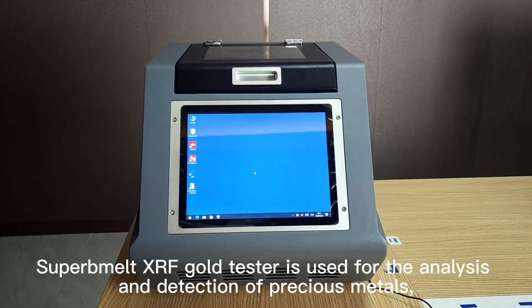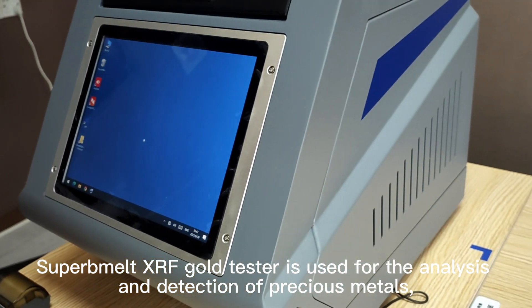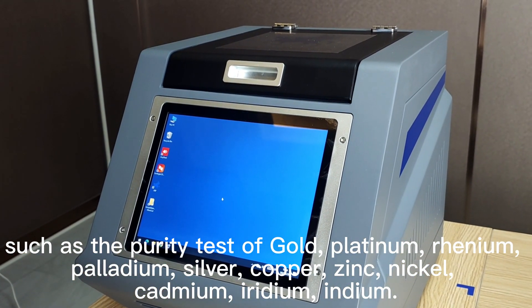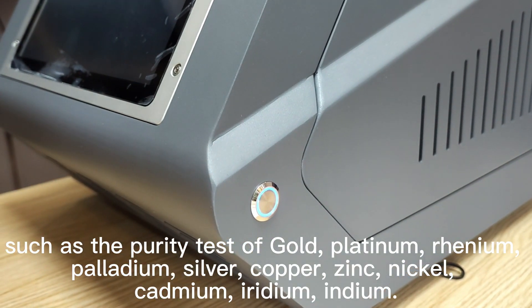SuperbMelt XRF Gold Tester is used for the analysis and detection of precious metals such as the purity test of gold, platinum, rhenium, palladium, silver, copper, zinc, nickel, cadmium, iridium, and indium.